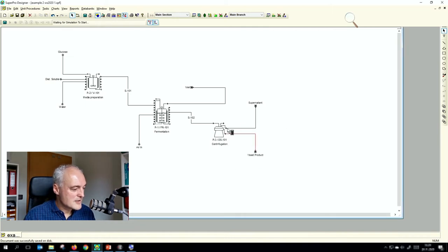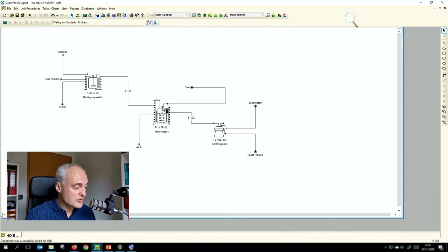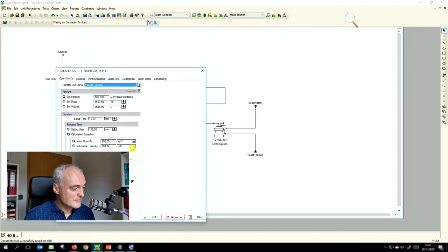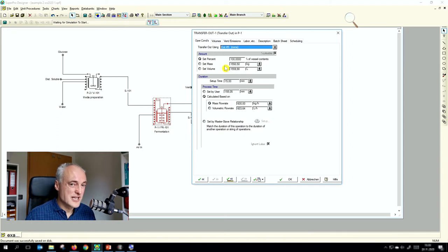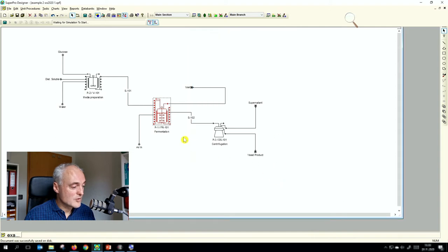Following the step-by-step approach, we go back to the bioreactor because we've redrawn a stream and need the mass balance to work again. We go to the bioreactor and re-initialize the transfer out operation — the stream may no longer be associated with it. Now it's on port four, everything is fine, and the stream is again assigned.